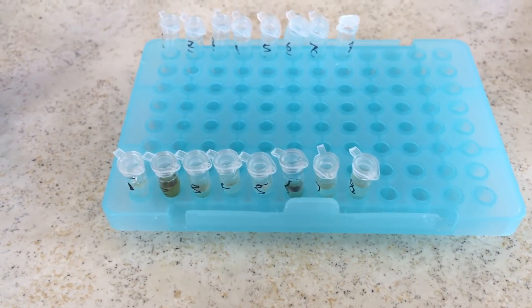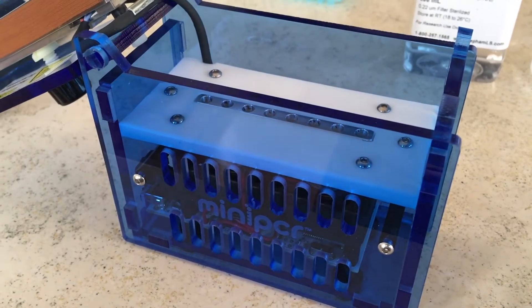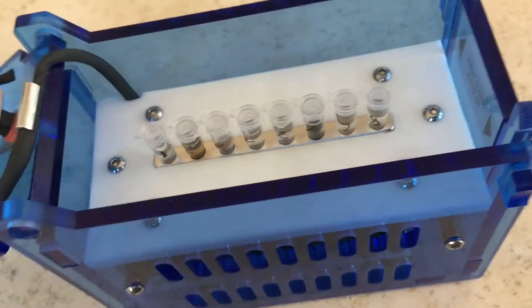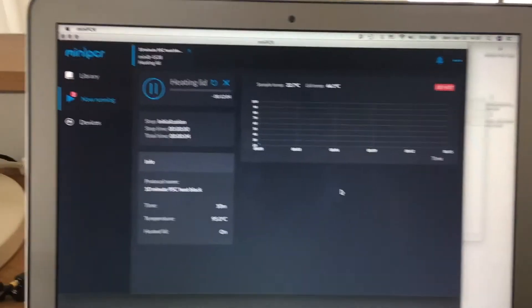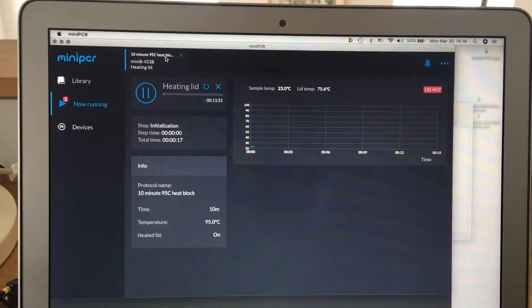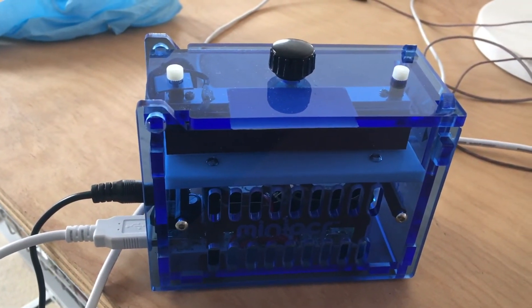Once you've put the buffer into each tube, load them into the thermal cycler for a so-called heat block — that means 10 minutes at 95 degrees Celsius so the heat can help break down the cell walls and liberate the DNA. Load them into the wells, close the lid and snap it shut — you can tighten it a little. Connect your thermal cycler to your computer and in the mini PCR interface set it to run the 10-minute 95°C heat block, then press go. You can actually hear it heating up.